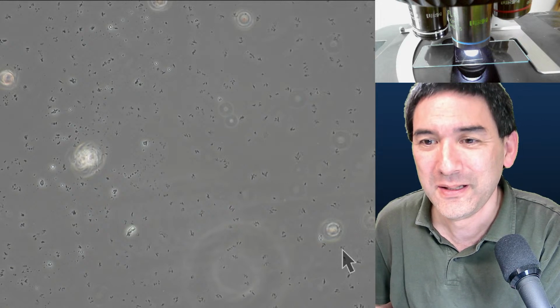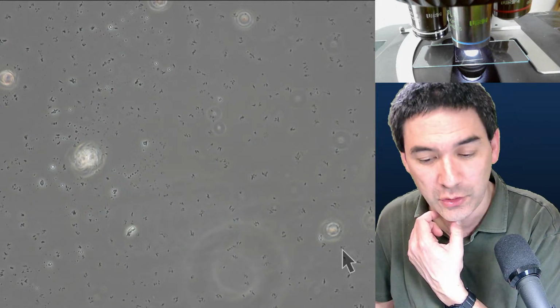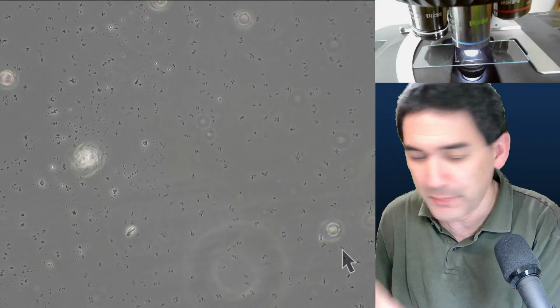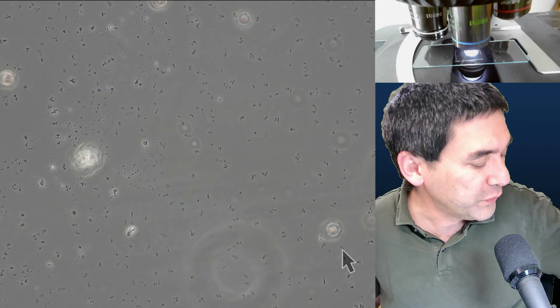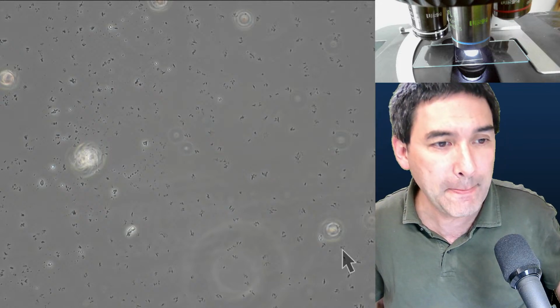Okay, I hope I didn't forget any questions here, but otherwise I'm going to move on a little bit. So these were the bacteria. What else did I want to do? I'm always checking the time a little bit. For a couple of minutes, I'm going to answer 5 questions.